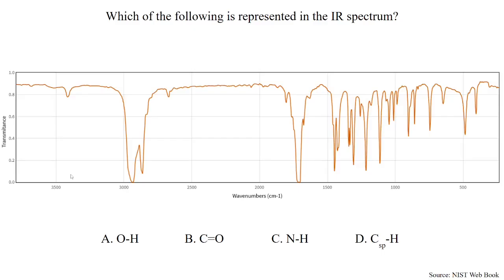Okay, so once again, we're mainly going to be looking at the left side of the IR spectrum. I probably should have mentioned in the last one: typically, you always want to analyze anything past 1500. Those are your more important signals, right? Anything below 1500, don't look at. But anything above 1500, do look at.